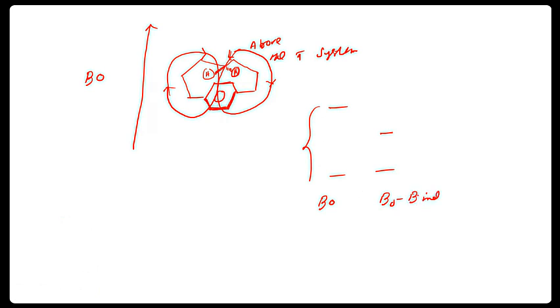I said earlier that if this value becomes larger, it will come at higher ppm. This value is very much smaller. That's why it comes around negative ppm. So this is highly shielded. Basically, it's about negative 0.65. Can you imagine? If the value were significantly low or ignorable, the ring current would not matter, but the ring current has significant value.